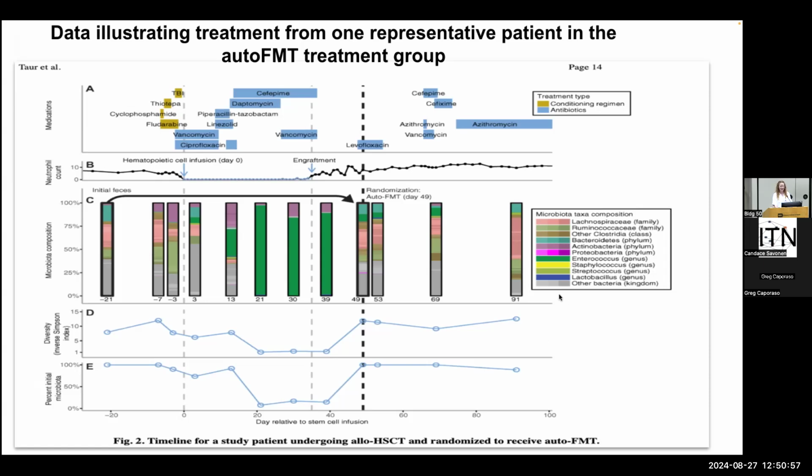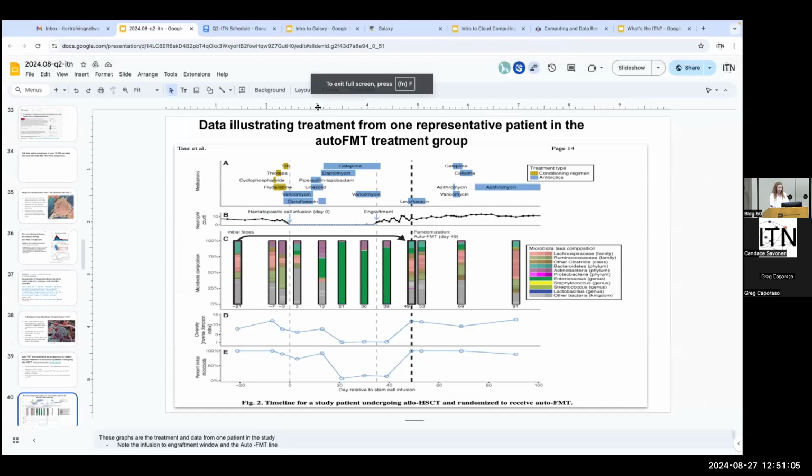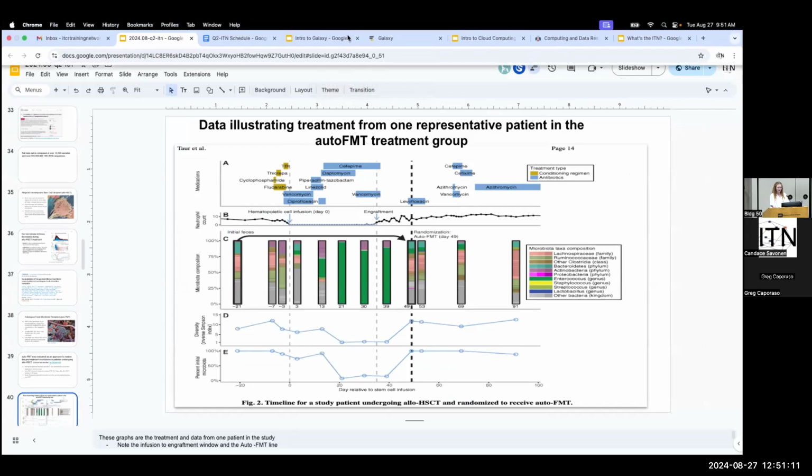Okay, let's do it. I am going to come out of here somehow. There. All right, so if you could go back to cancer.usegalaxy.org, I believe it is. Use Galaxy, thank you. And actually, we need to open our tutorial. Oh, am I frozen here? Sorry, the Zoom menu is in the way always. There we go.